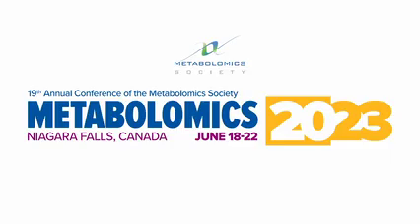Because the peak goes from baseline, goes up and then goes down. Are you talking about the very first step, the mass detection, essentially? Yeah. So we do that for all the scans because it actually reduces the size of your data.